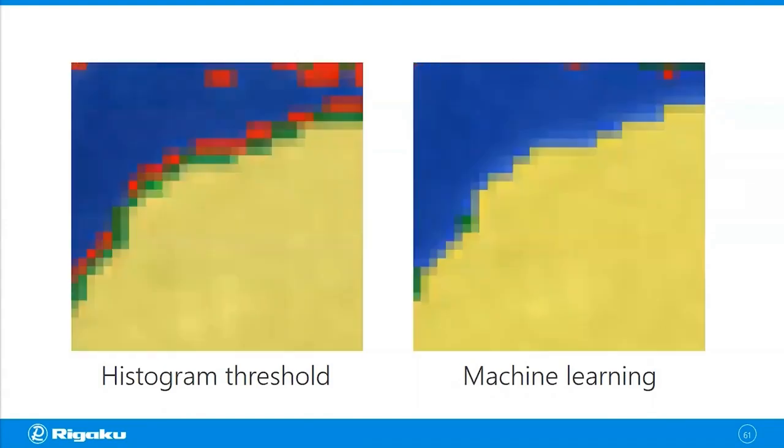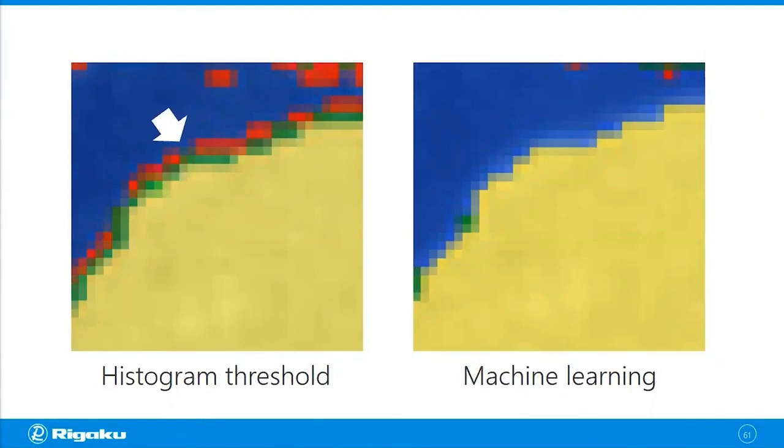I'm going to show you a zoom-up. So in the threshold-based segmentation result, you see those red and green lines or frames around the yellow phase. You don't see the same problem in the machine learning result.